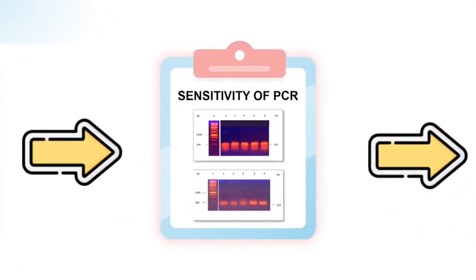For the results, the detection limits of PCR, or sensitivity of PCR, are as follows.